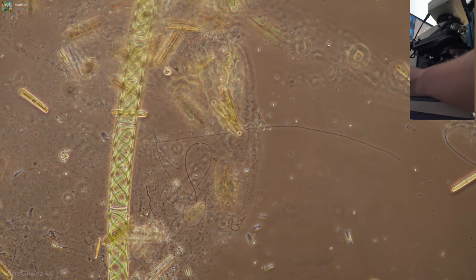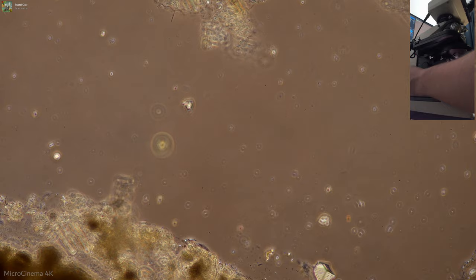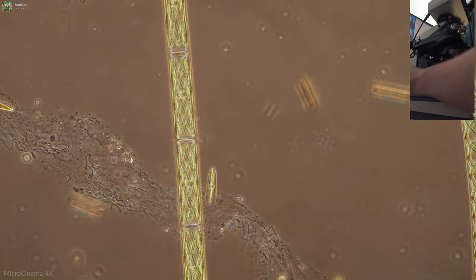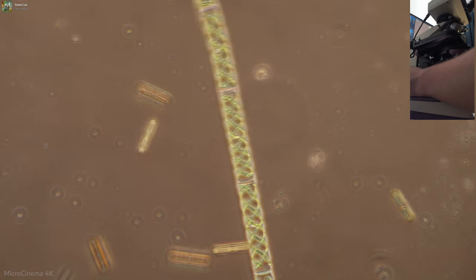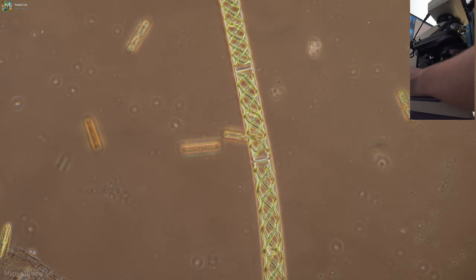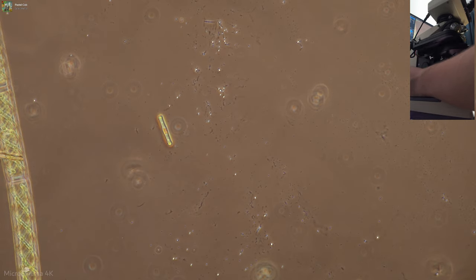And so yeah, we've gotten basically all the way through kind of the... These are pretty much the major illumination styles that you have on a microscope. And so this is just super cool.